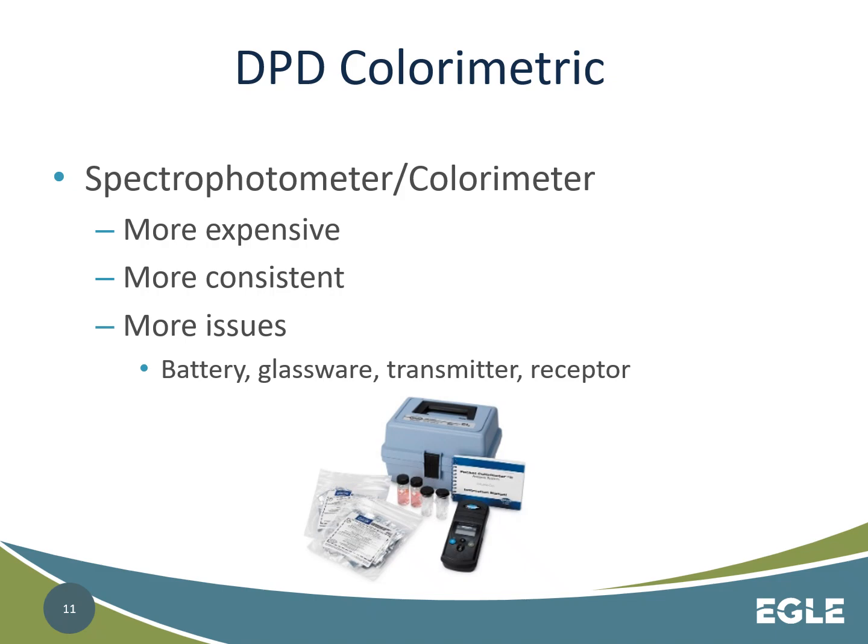So that's really about it. The light source doesn't matter for this. Inconsistencies in vision have nothing to do with errors in reading on this machine.